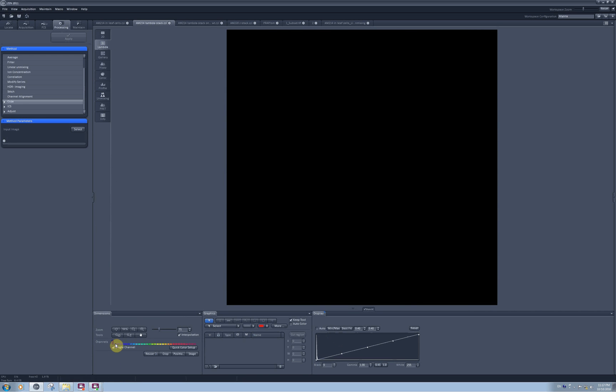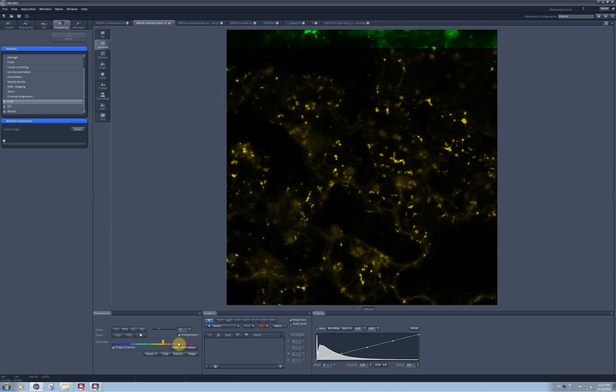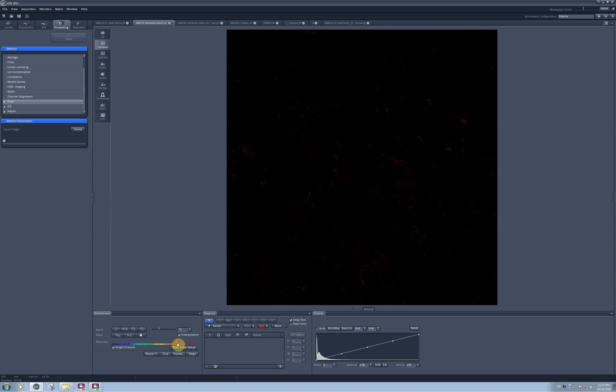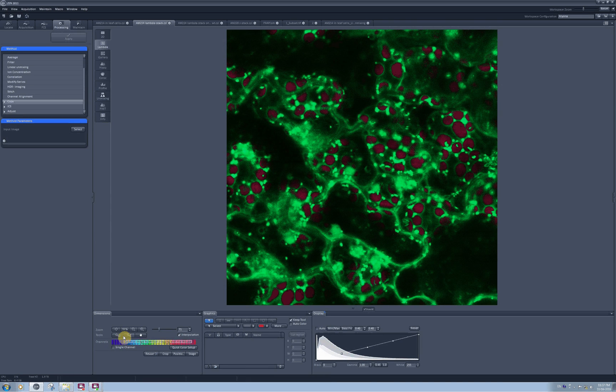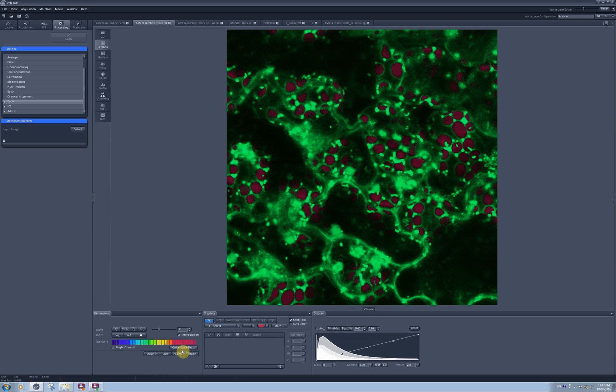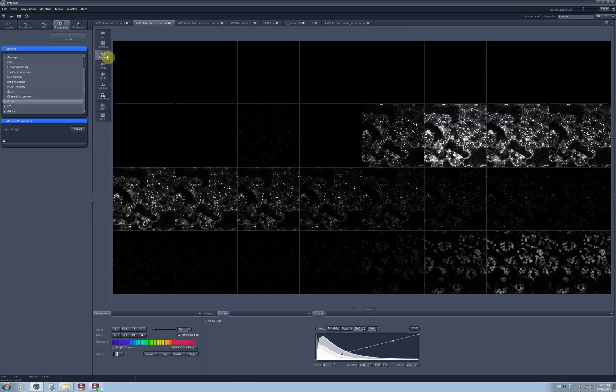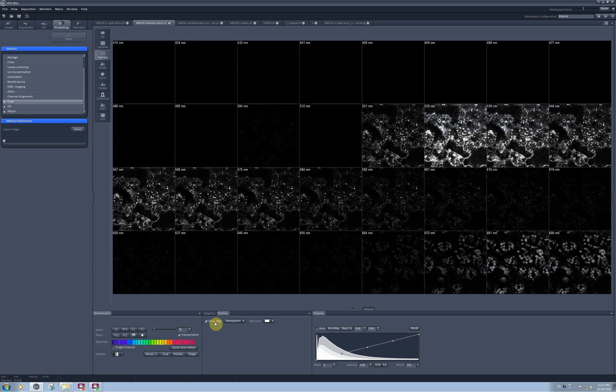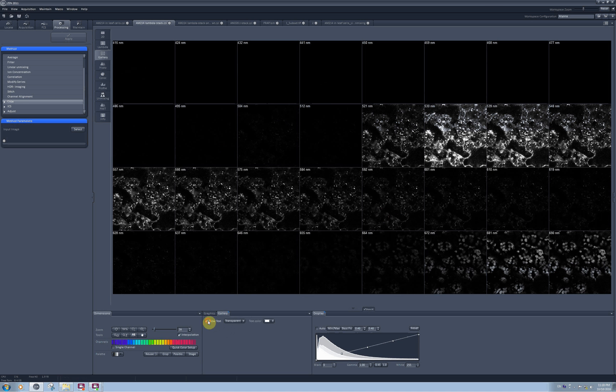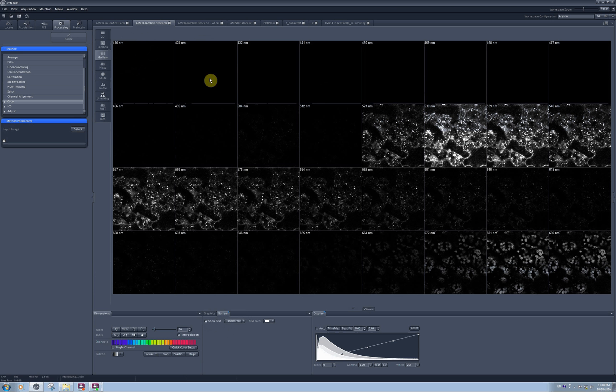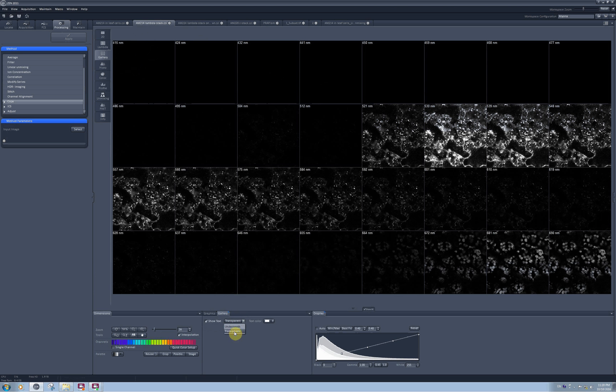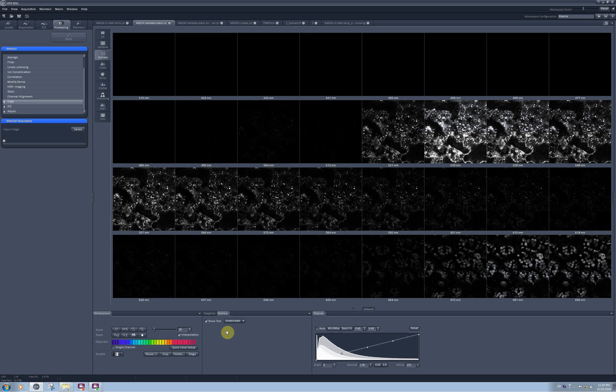When I click on single channel, I can scroll through individual channels to see which one of them detected the signal, or I can see all channels simultaneously. In the gallery, I will be able to see an image from each of the 32 channels I used for making this image. If I click here on the show text, I will be able to see approximately what range was detected by this channel, and there are two ways to show this text, either transparent on the top of the image or underneath the image.